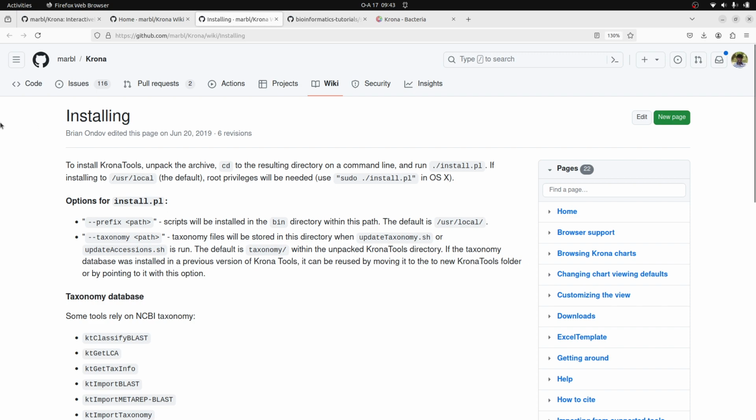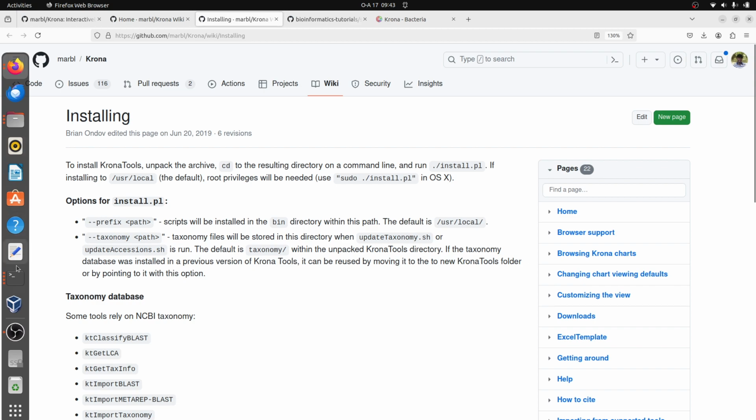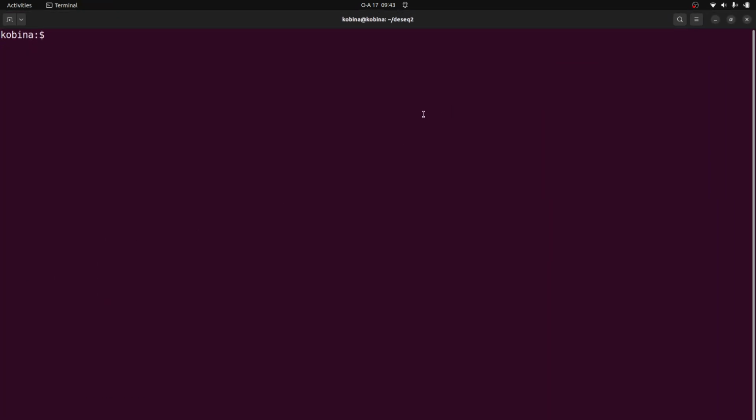Okay, so let's open a terminal. This is my terminal. And then let's do a cd to our home directory. That's very important. We want to set this up in a place where you can easily access. This tutorial has been made specifically for beginners, all right? And also you don't need admin access to install this particular one. The approach I'm using, you don't need admin access. That's why we are going to the home directory by using the cd command.